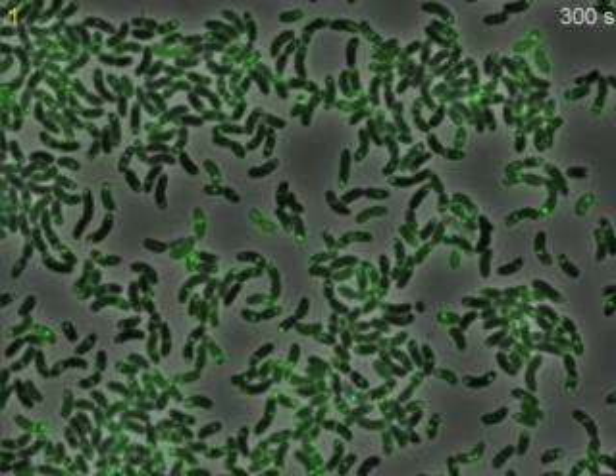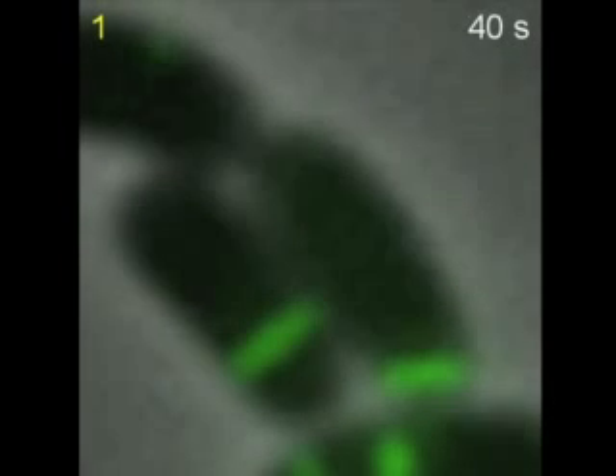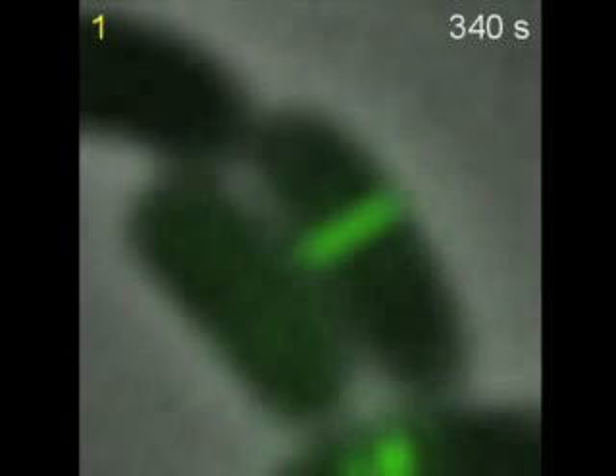By tagging one of the proteins of the system with GFP, we discovered that in live cells the type 6 secretion appears as an elongated structure that first assembles, then rapidly contracts and finally disassembles. The cycle can be seen well in these close-up views of individual cells. Whereas assembly occurs over tens of seconds, firing is quick and takes less than 5 milliseconds.